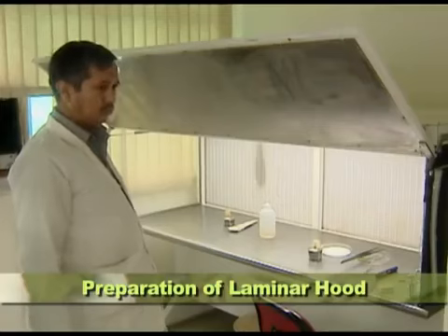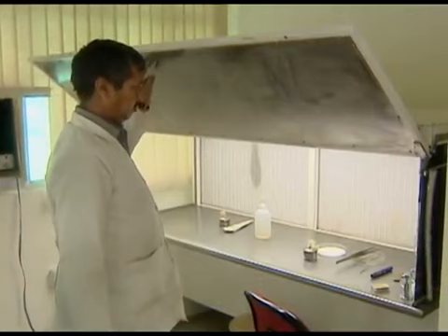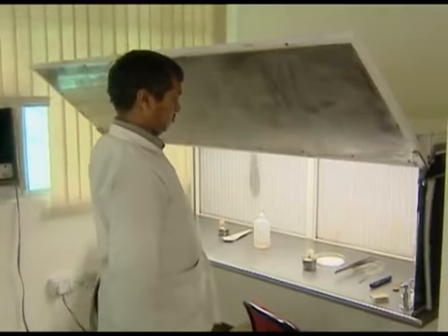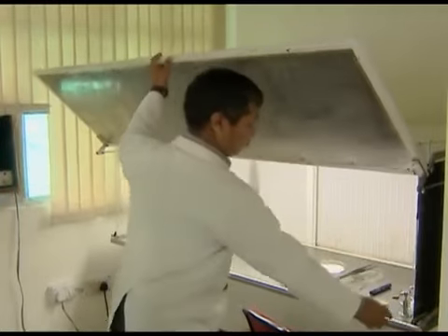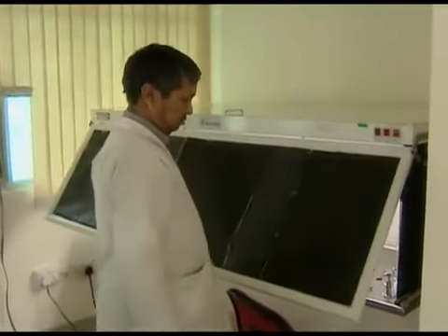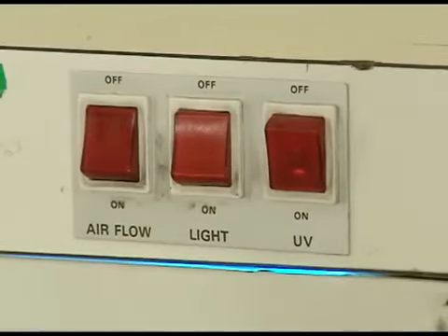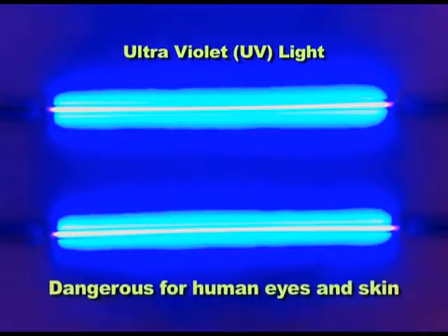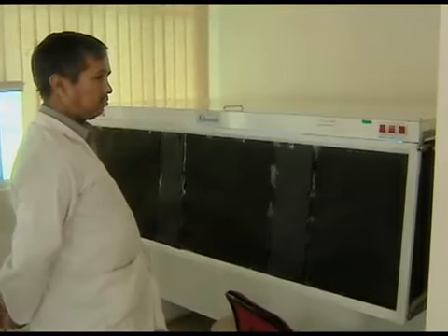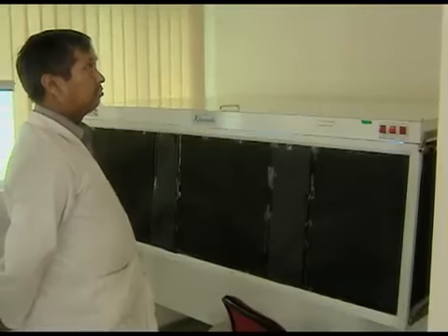Preparation of laminar hood. The laminar hood is a special equipment for inoculation. Shut the shutter of the laminar hood. Switch on the UV light for about 30 minutes. While the UV light can kill all the microbes, it is highly dangerous for human eyes and skin. Therefore, the shutter has a black sheet and is not opened until the UV light is switched off.